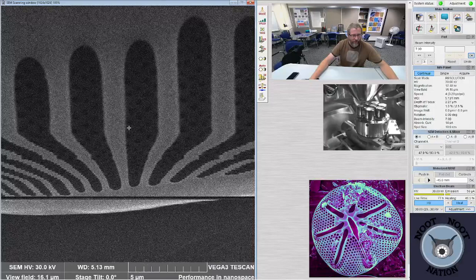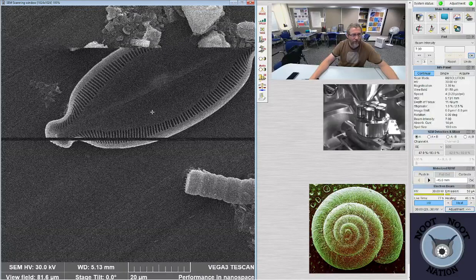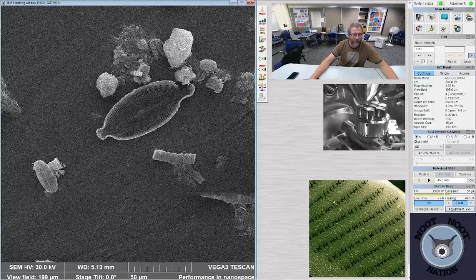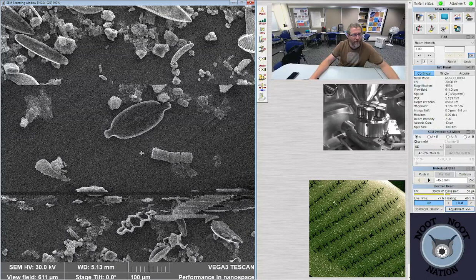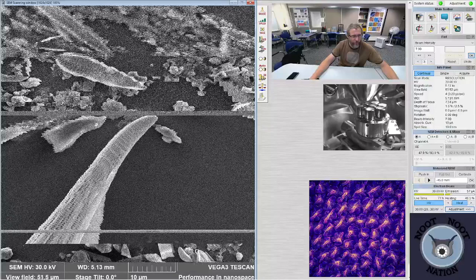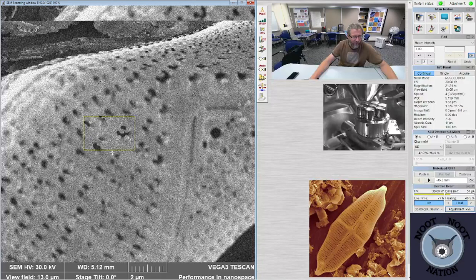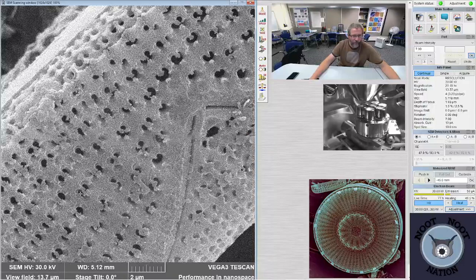I know this one to species because one, I've had it before in samples, and two, it used to be my wife's favorite diatom, so when I see it, I always know which one. It's a cool diatom. I want an external view of that if we can find one. It'd be cool. Terpsinoe is also a really cool diatom, and that's an Epithemia. They have really cool structures on the outsides of them as well. Their striae are like, I don't know, intricate. See that a little bit in here. Looks like it's a bit dissolved.